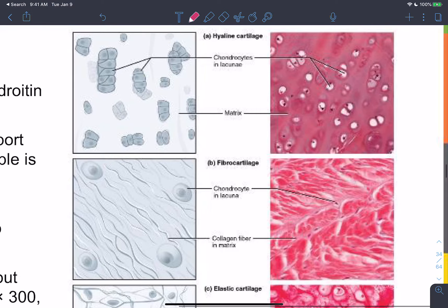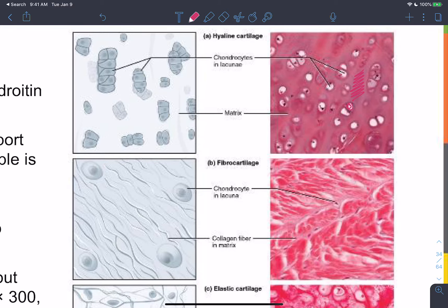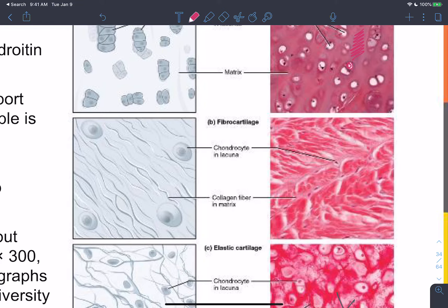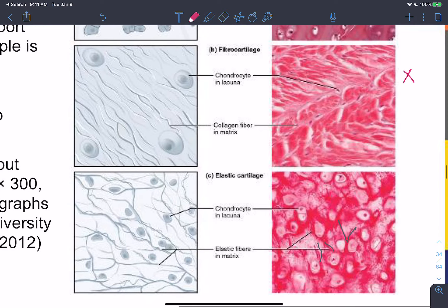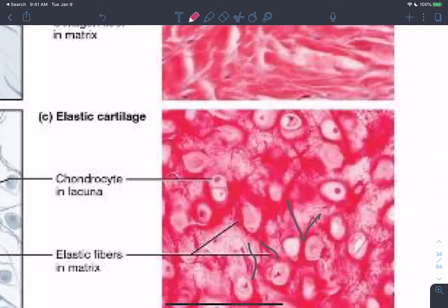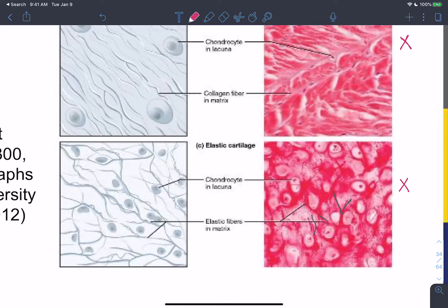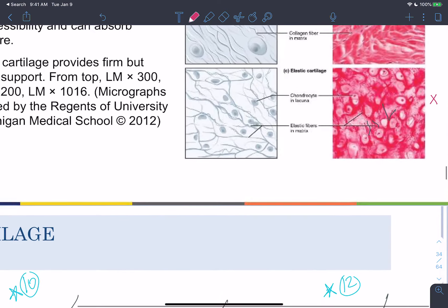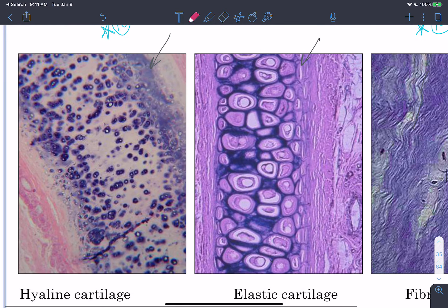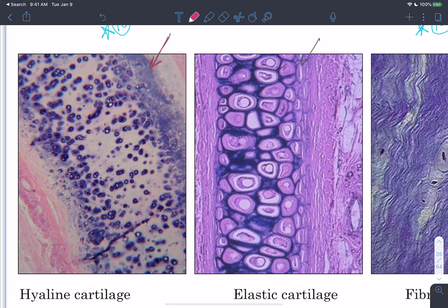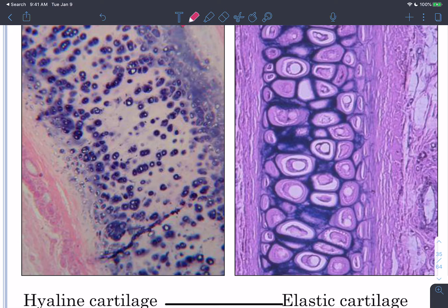A comparison diagram shows all three cartilage types. Hyaline cartilage: chondrocytes in lacunae with a homogenous matrix and no visible fibers — a very characteristic appearance. One slide in the diagram is not clear and not typical, so don't expect it on your exam. Hyaline cartilage has a very characteristic appearance with no visible fibers between chondrocytes.